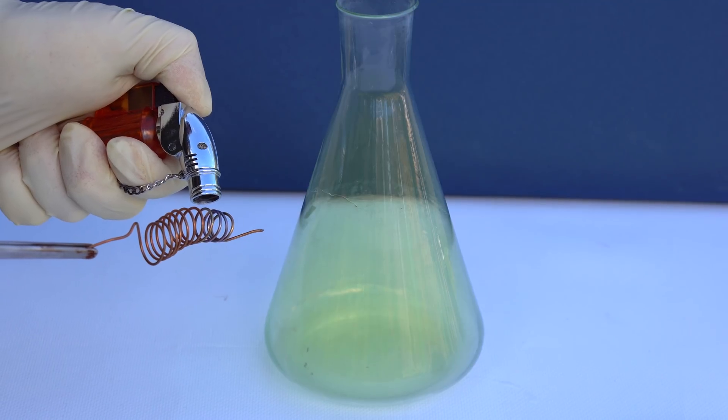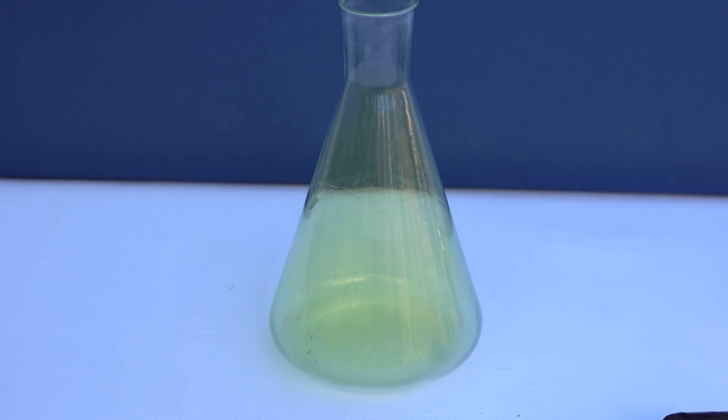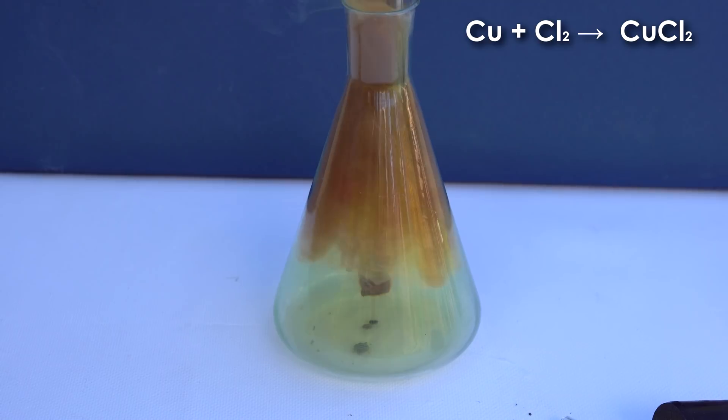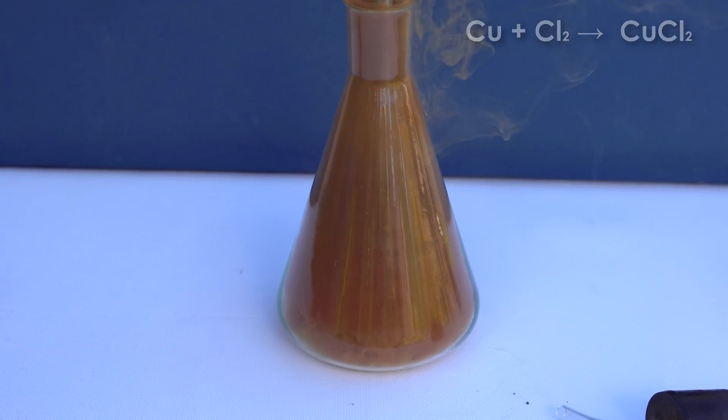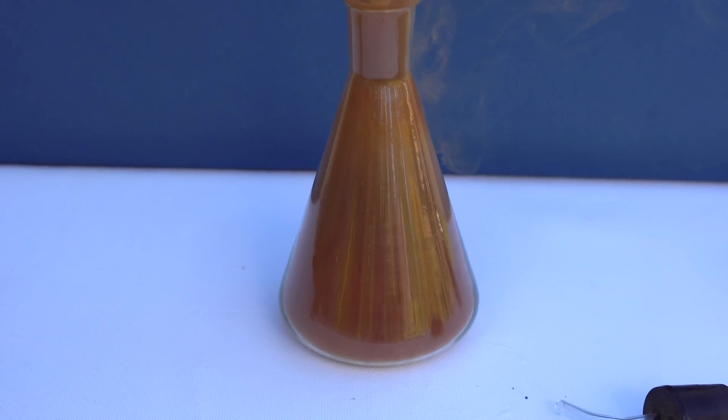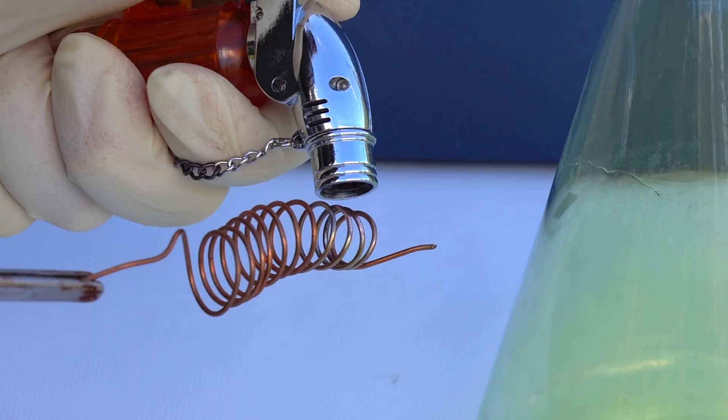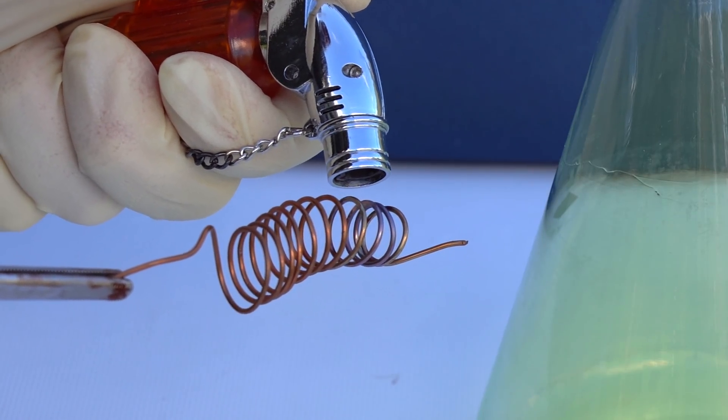Also, copper wire can burn in the atmosphere of chlorine. Once it is only slightly heated with a lighter and lowered into the flask with chlorine, copper immediately begins to oxidize to form copper chloride, which also forms brown smoke in the flask. However, with the oxygen in the air, copper does not react this way because of the formation of an oxide film on the surface of the metal.